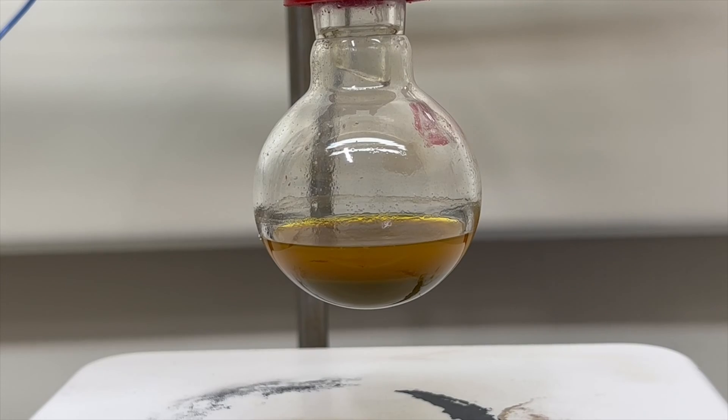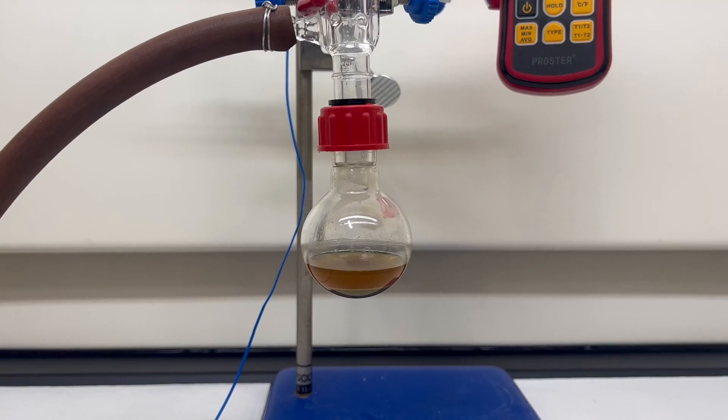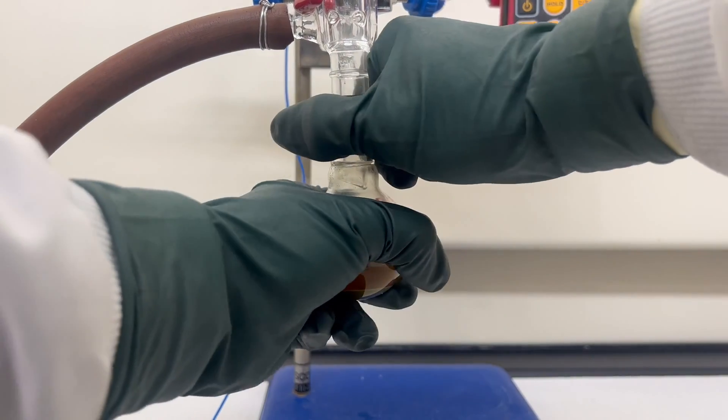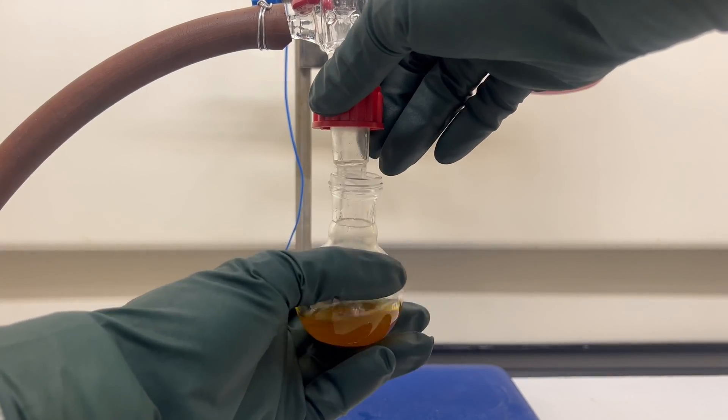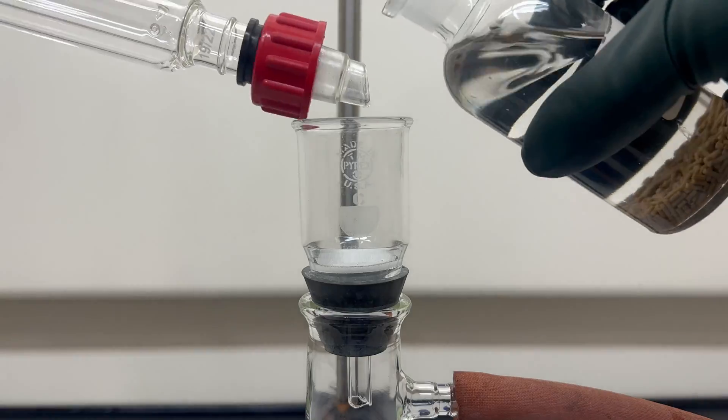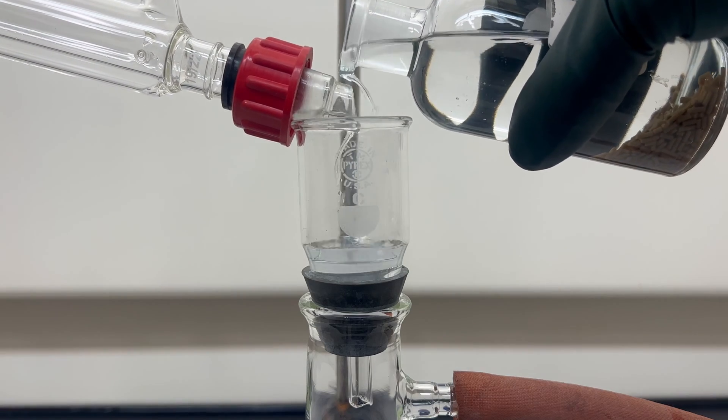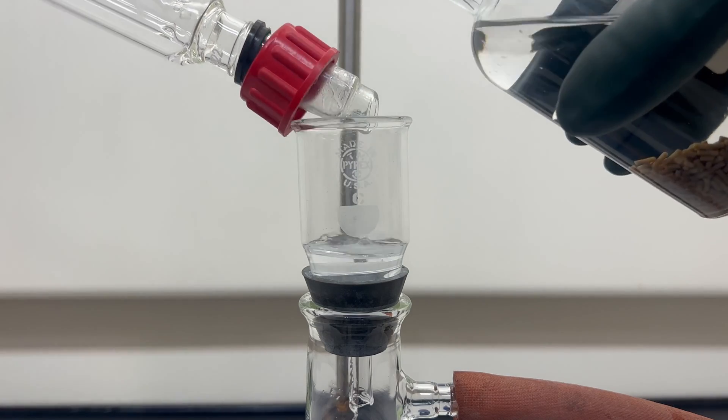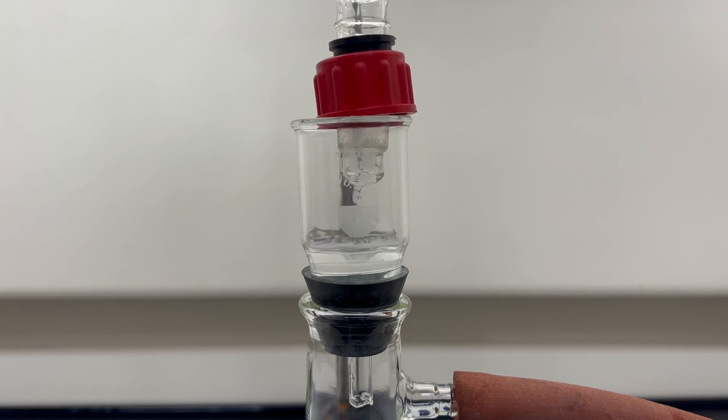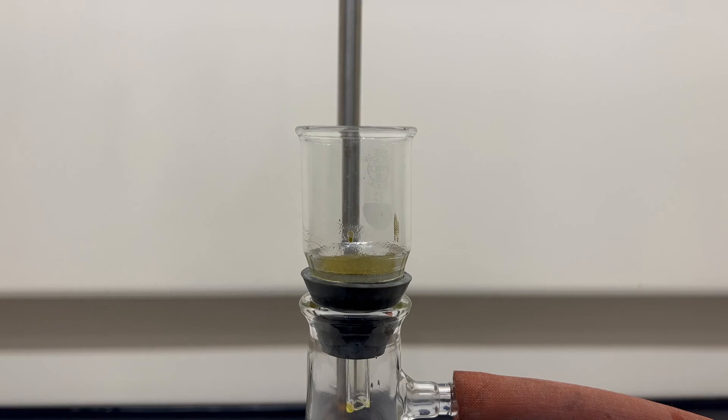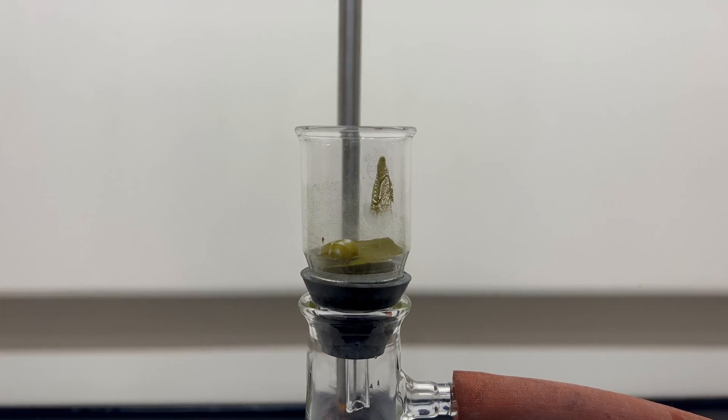After the reaction completes it's allowed to cool to room temperature. The reflux condenser is removed and rinsed into a fritted filter. Then the material in the reaction flask is transferred to a fritted filter. It took a few washes to transfer the material completely.